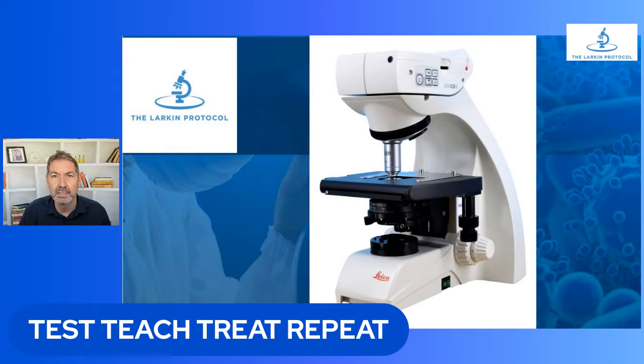So, this is a Leica laboratory grade microscope. And most microscopes have the capability of four objectives, but I found the right person to help me custom design this because one of the things that I wanted was simplicity. I wanted to be able to do this virtually. It had to be simple. If I have four objectives on a microscope and a person is turning the wheel and saying, which one do I use? And this and that and the other. So there's one objective. We've made this very simple.